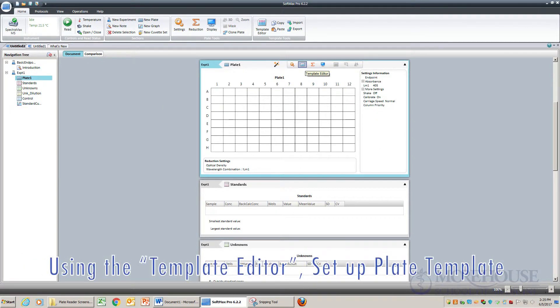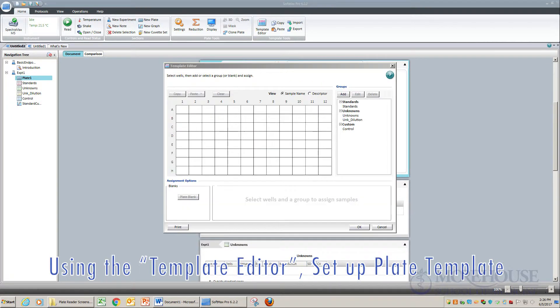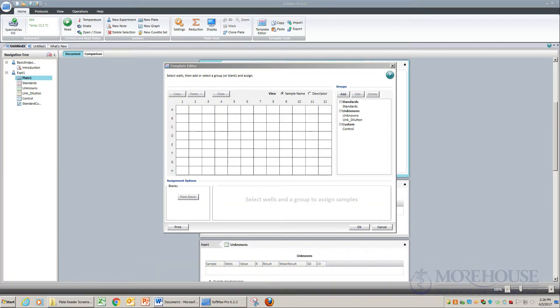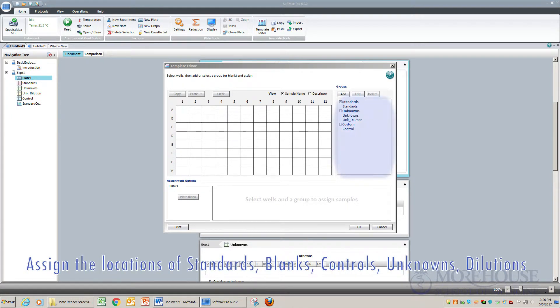Using the Template Editor above Template Tools, set up a template of your plate. Assign the location of your standards, blanks, controls, unknowns, and dilutions.